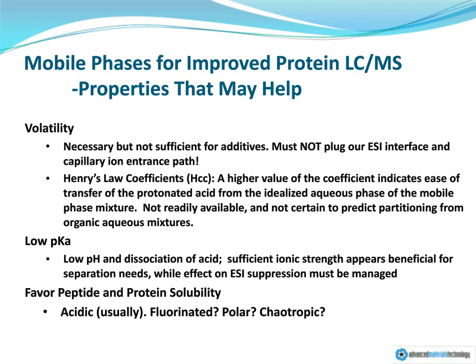The biggest consideration, though, is if we're to use new mobile phase modifiers for protein separation, we must really consider solubility. If we have materials that we are injecting onto an LC system that are not fully soluble, we will certainly have, at very minimum, complex peak shapes and recovery problems. And, in fact, this could extend to just blocking the flow path and overpressurizing the system. So as we begin to look at different alternatives, we have that additional set of criteria to consider.